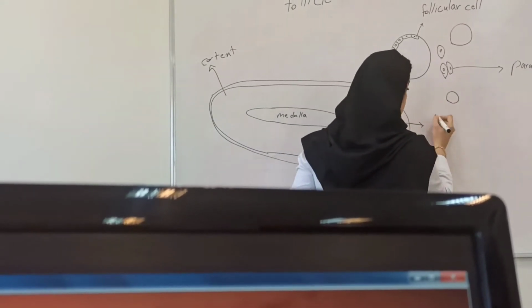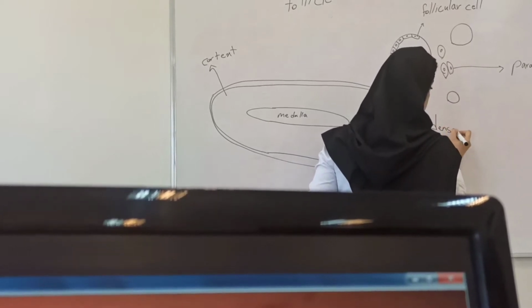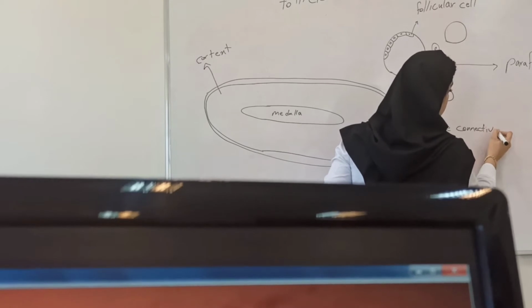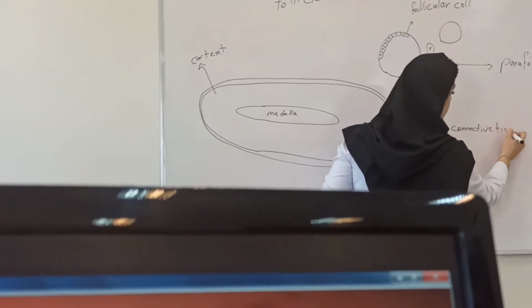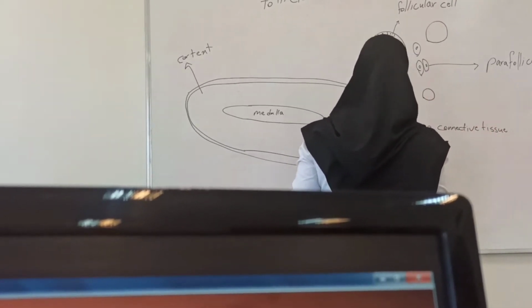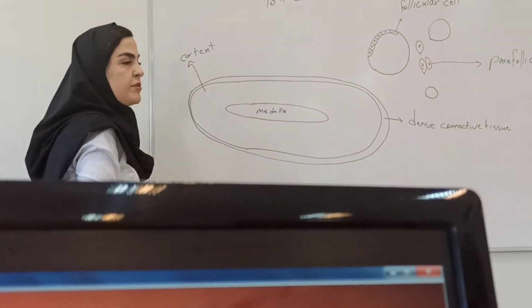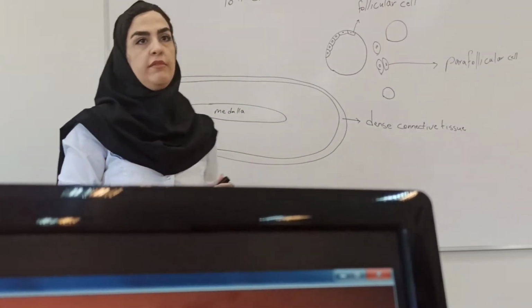The capsule is dense connective tissue. So the gland is covered by a capsule of dense connective tissue.